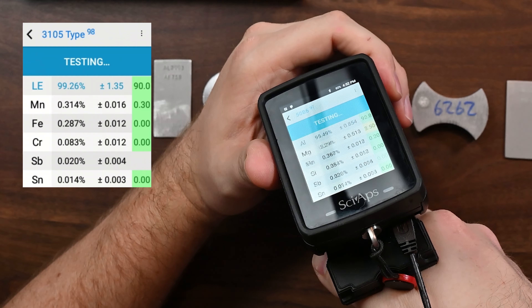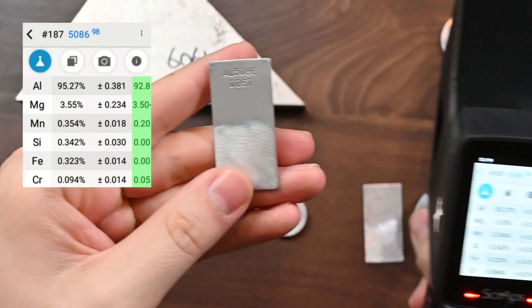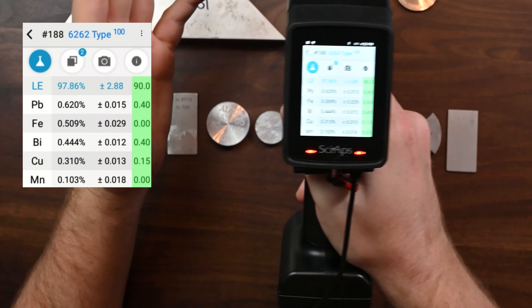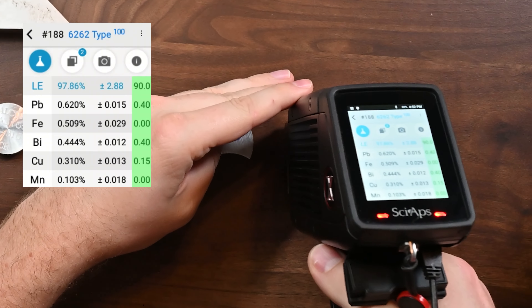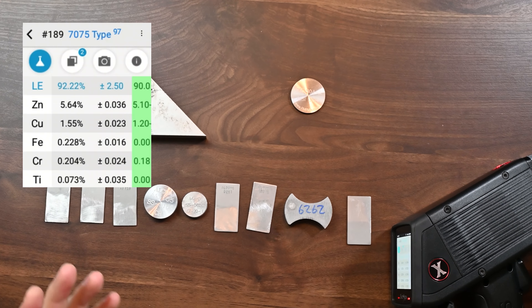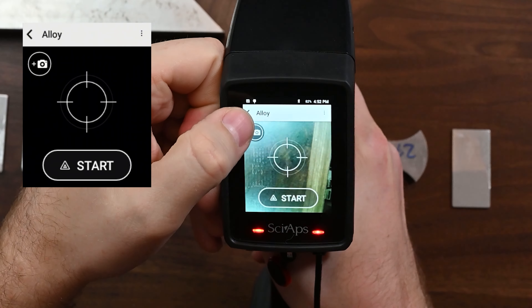We'll hold the analyzer a little bit longer until we see the switching beams — we switch the beams over, run it for just a second, and now we're at 5086. You can see that this sample needs the light beam in order to sort, and this is where you can run into some trouble when you're sorting aluminums. This is a redundant 6061 here. Let's shoot this 6262 — it has bismuth and lead in it, and that's an easy alloy to identify with handheld XRF. Now, this is a 7075 alloy — it has some heavy element capability, so I can see that really quickly with just the heavy beam. So most of the alloys can be sorted with just the heavy beam, and you can do so really quickly.